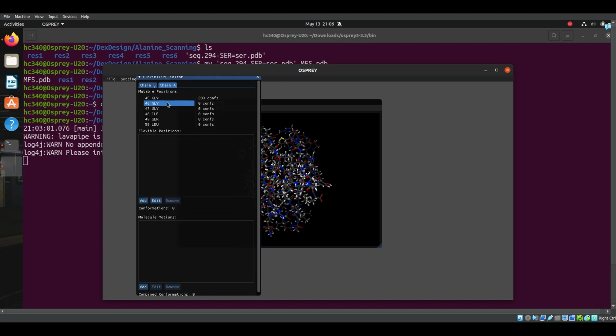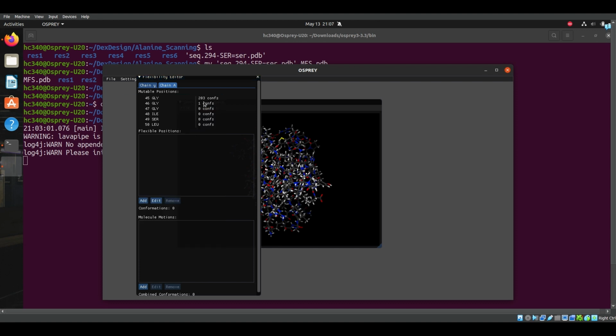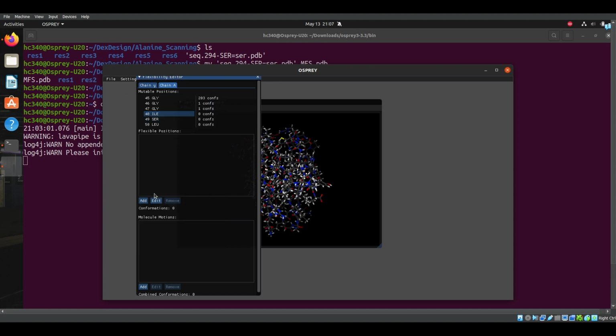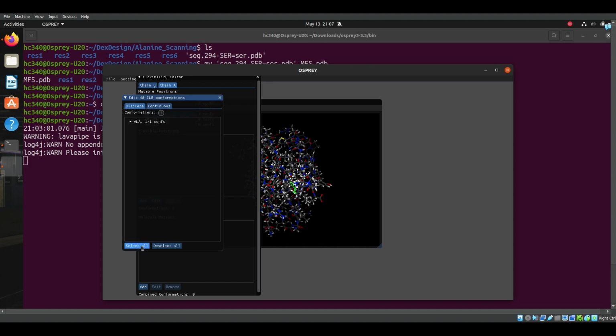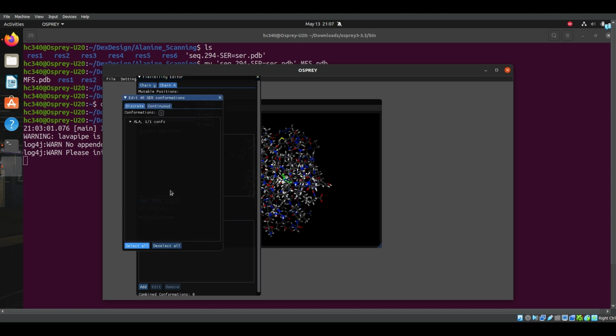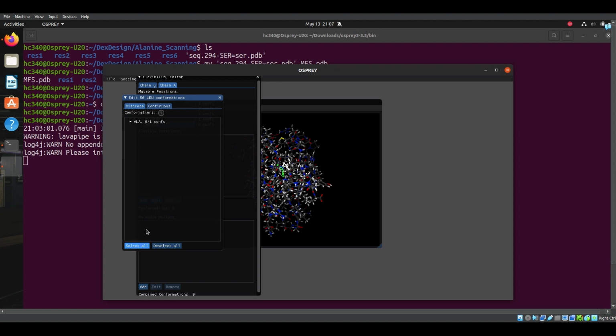Close this menu. I'm going to go through and do that for each of these alanine mutations on the remaining residues. So hitting again, clicking the residue, clicking edit, and then select all. Also click it, select from here, edit, select all. Last residue, leucine, edit, select all.